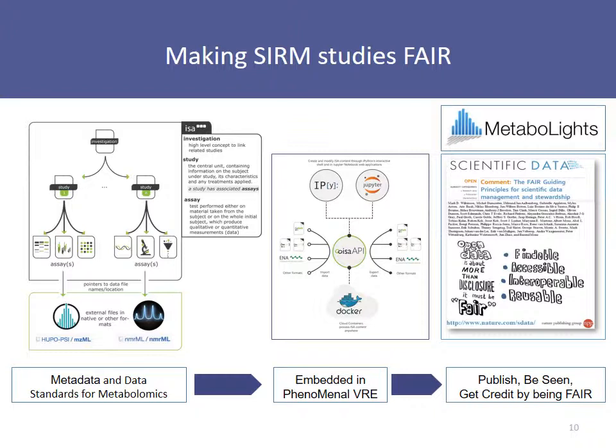To accommodate the needs of these studies, the ISA format is used to report study setup, while raw data are standardized to mzML and nmrML formats for MS and NMR respectively. A dedicated data matrix extension is now available to specifically structure mass isotopolog and mass isotopomer reports, and is integrated to RAMID, MIDCAR, ISODIN and ISO2FLUX tools. So, implementing standards does not have to be taxing. Simply use phenomenal workflows, like this for fluxomics.